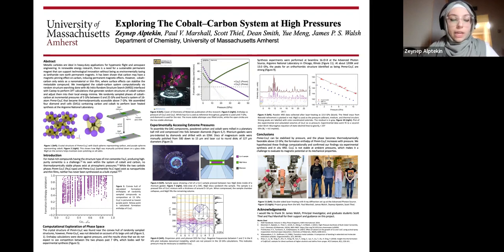We also had to manually polish magnesium oxide discs. You can see in this image here, we had these frosted glass slides, and we had magnesium oxide in the middle, and, increasing the grit of our sandpaper, we got it down from 500 micrometers to about 15 by hand. So it was a pretty delicate process. We sent those to the Argonne National Laboratory, where they laser cut circles for us. And magnesium oxide acts as an insulator and also as a pressure calibrant for us.